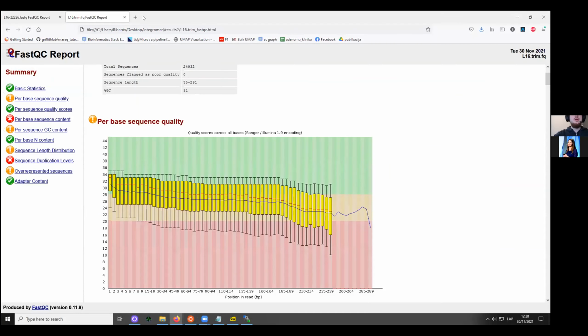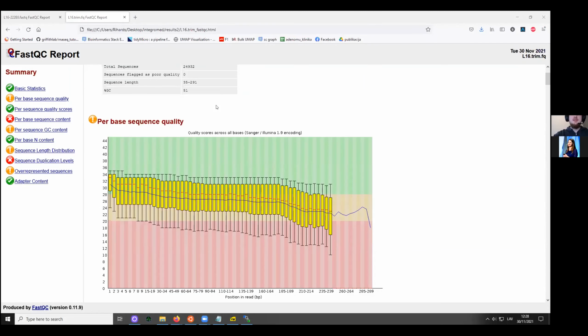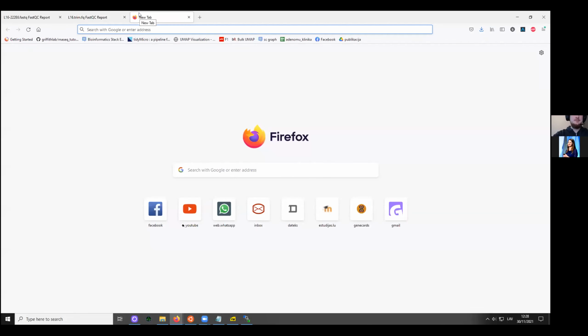What we will do next: the VCF format is fine if you want to filter it and subset your SNPs for further analysis, but it's not very visually pleasing, or good for presentation.